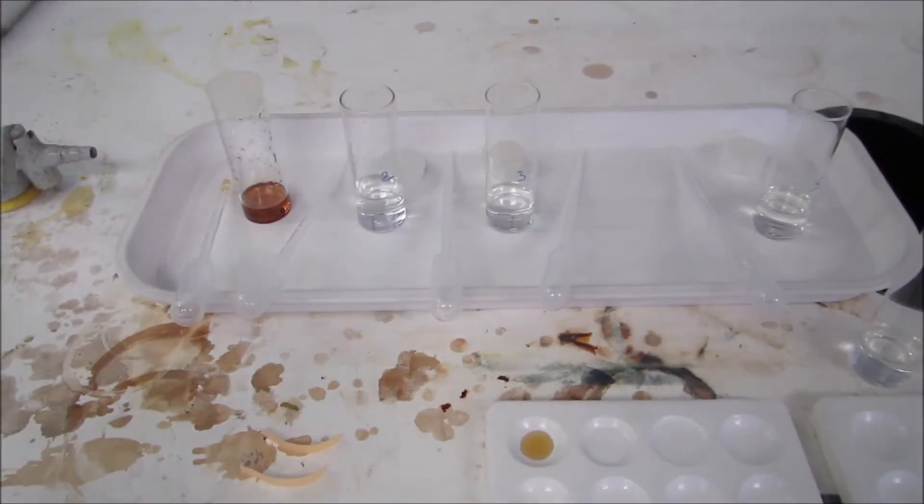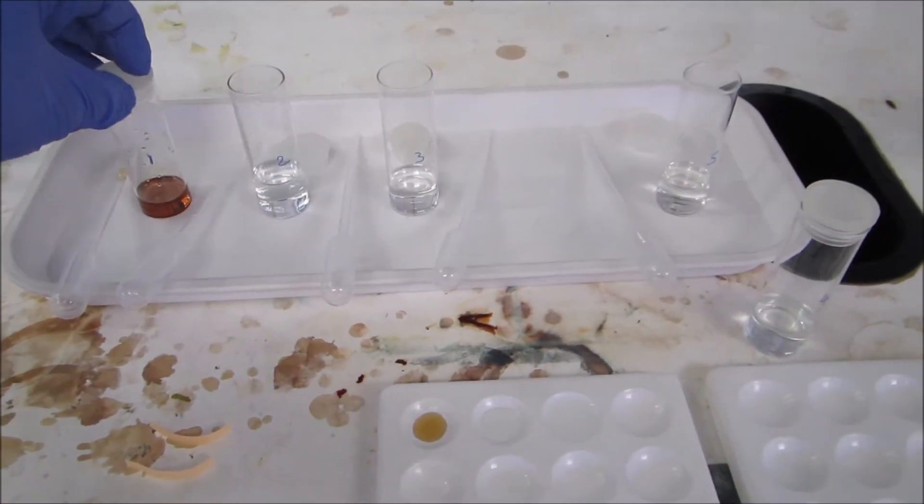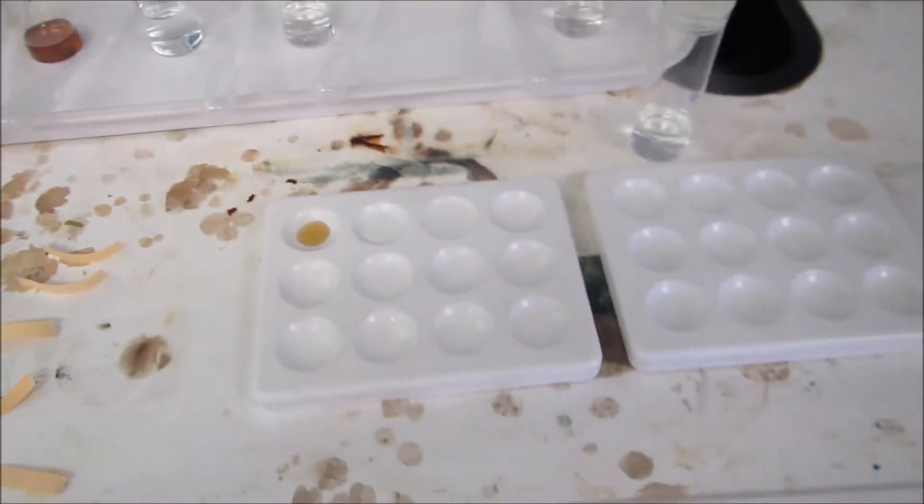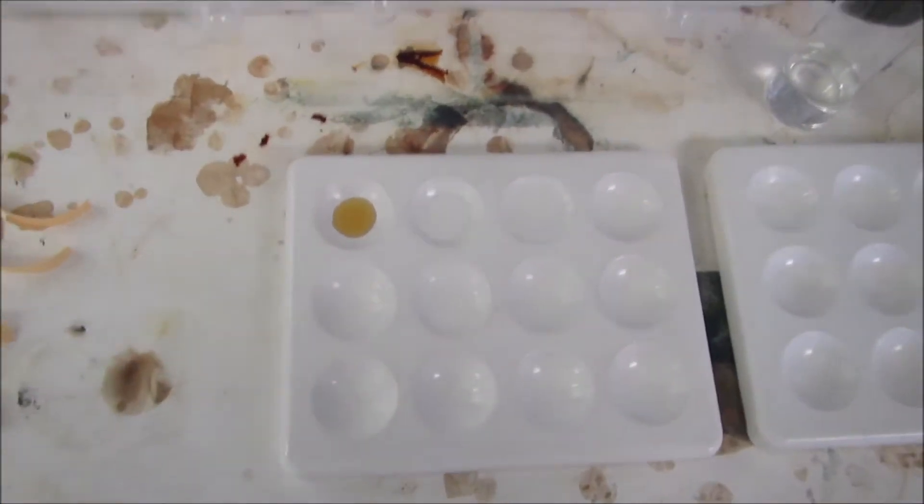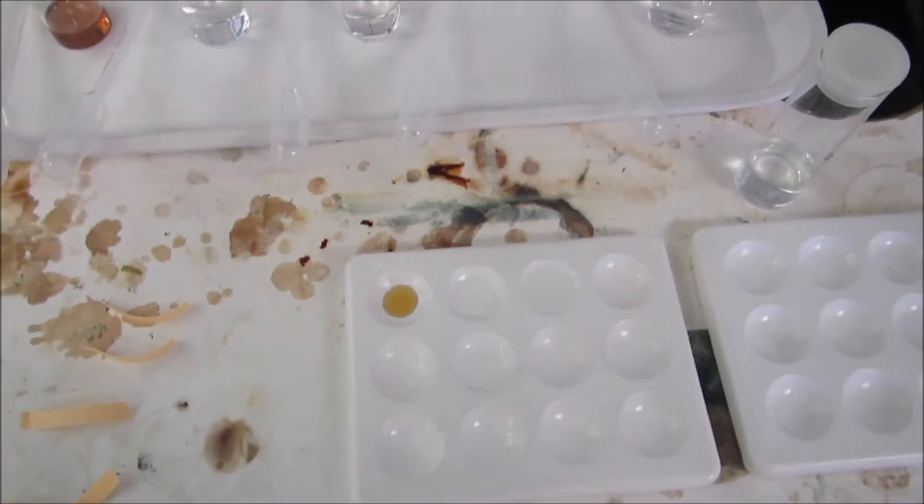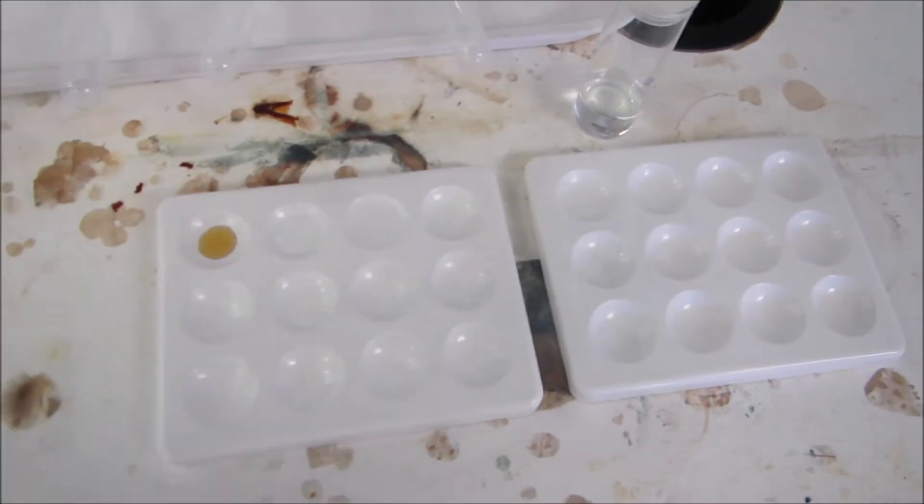So I now have five unknowns that I'm going to perform organic tests on, and you can try and work out what they are. I've put some of all of them into the spotting tile.